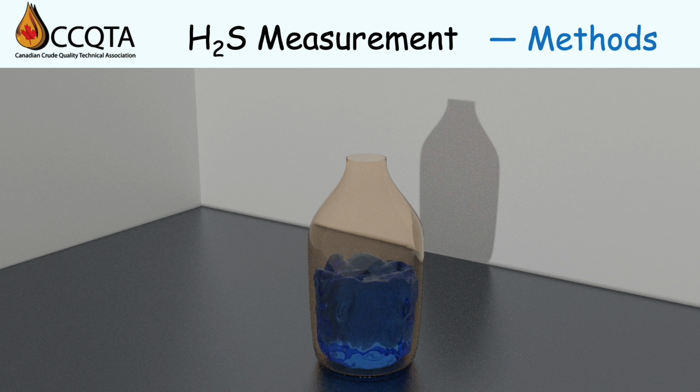Secondly, the test heats the sample to 60 degrees Celsius, so that increases the vapor pressure even more. Although the test bottle is sealed with a stopper during the heating step, the stopper is removed and is replaced with foil and then agitated. Both of these activities are further opportunities for loss.